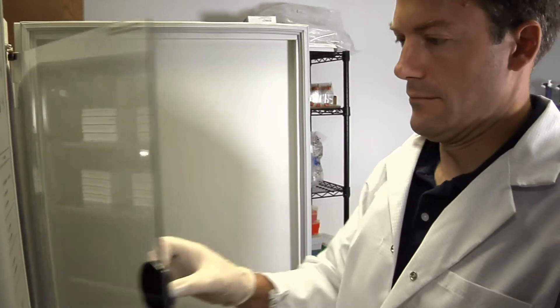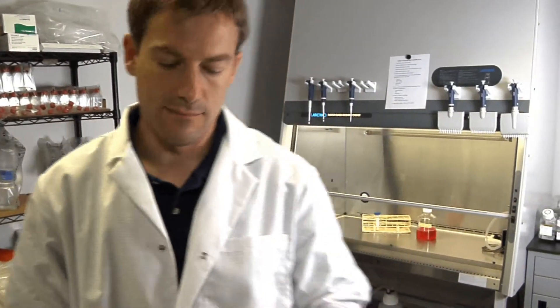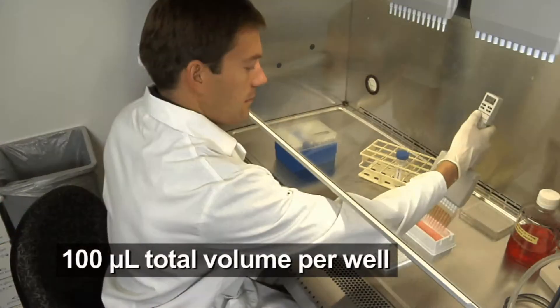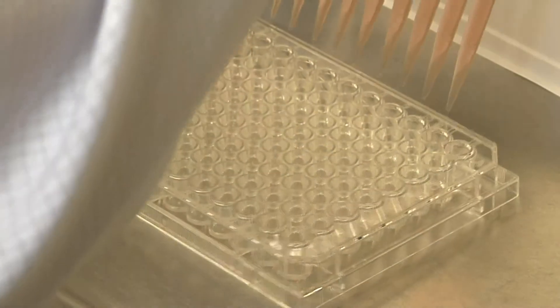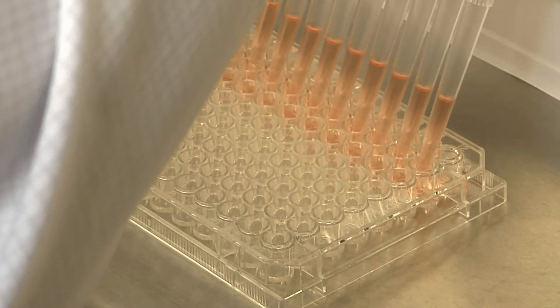On day 1, seed low-passage adherent cells so they will be 80–100% confluent for transfection 24 hours later. Using highly confluent cells is key to achieving good results. Seed the cells in a white 96-well tissue culture plate in 100 microliters of total volume. In parallel, seed the appropriate number of cells in a clear plate for assessing confluence.